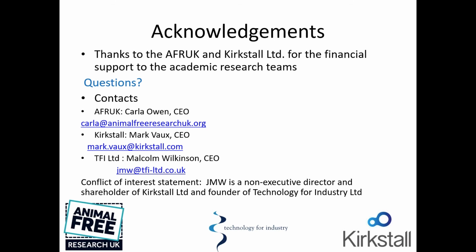And I think what's interesting in our experience is the blood-brain barrier has been one of those barriers that we've been collaborating with different academic groups on, and it's clear that the flow in these sort of systems stimulates the creation of a much more robust, stronger barrier, measured by simple techniques like trans-epithelial electrical resistance.